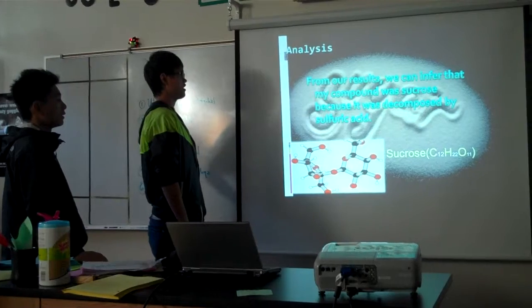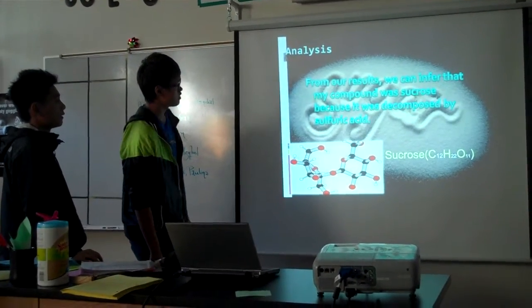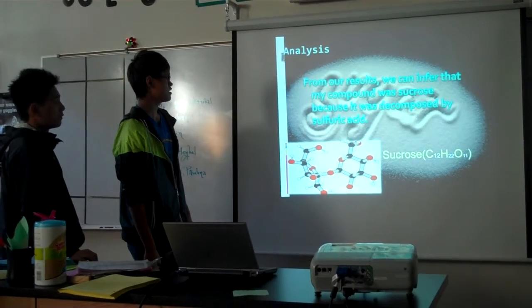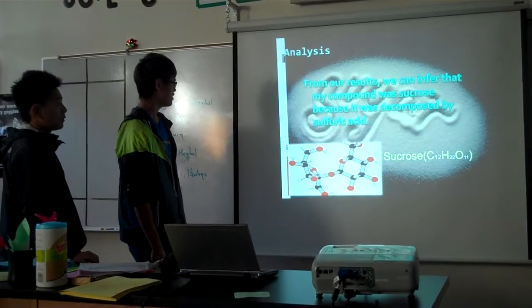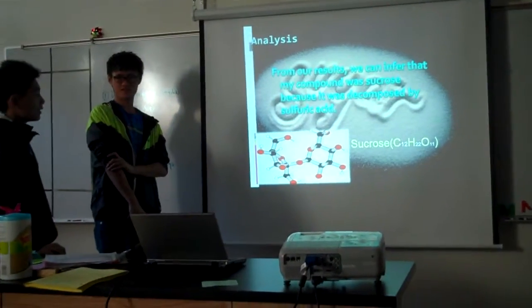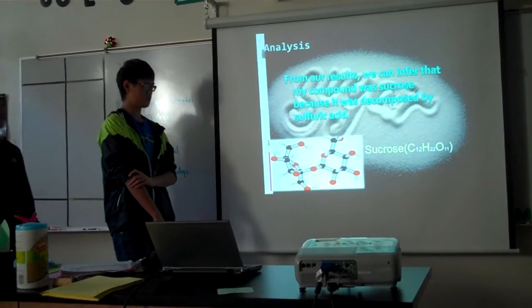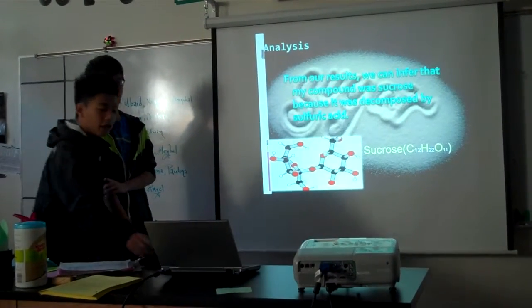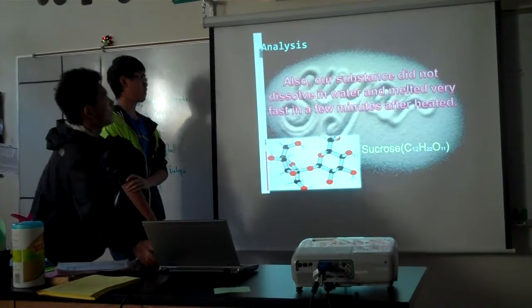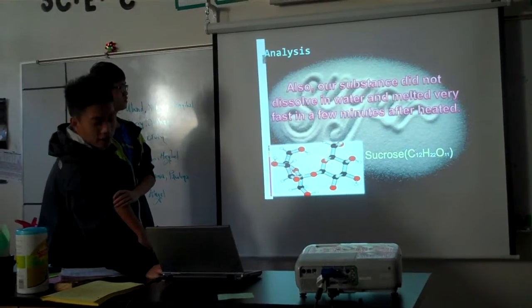Result: we can infer that my compound was sucrose because it was decomposed by sulfuric acid. The chemical formula of sucrose is C12H22O11. Also, our substance did not dissolve in water and melted very fast, in a few minutes after heating.